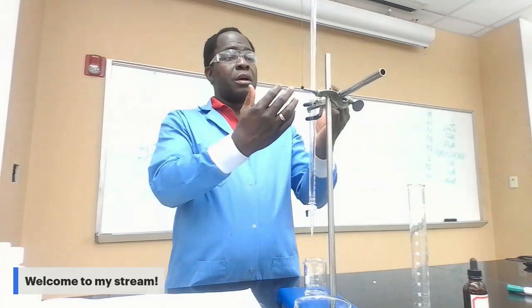You drain it out, and then you wash the burette with water. You don't have to take it to the sink. All you have to do is get a beaker, fill it with water, come to your lab station, pour your water inside, fill it up to 50 with water, and then drain the water out. That's how you get your burette clean. Okay, so thank you for your attention.